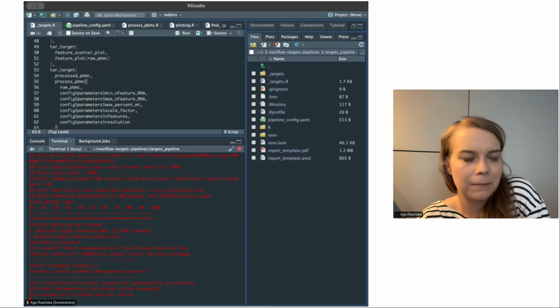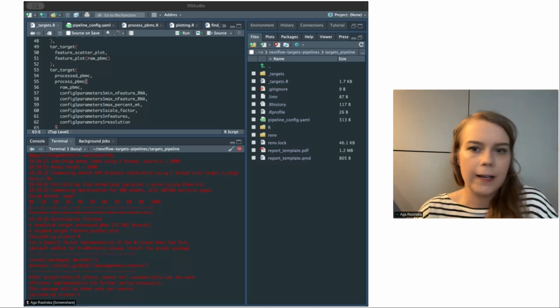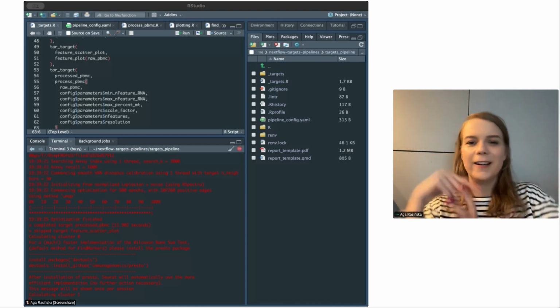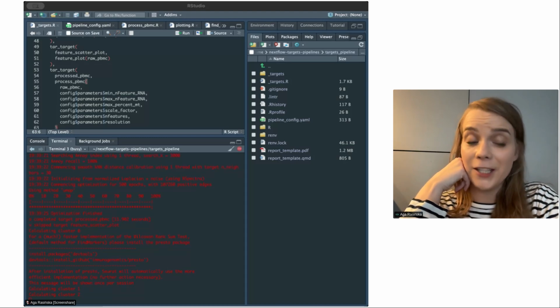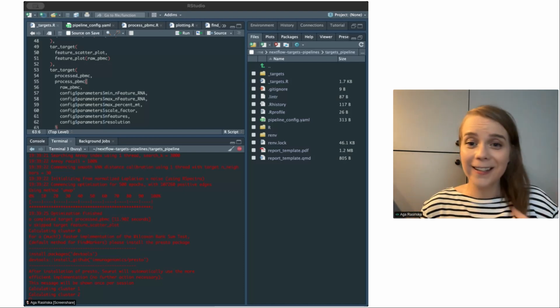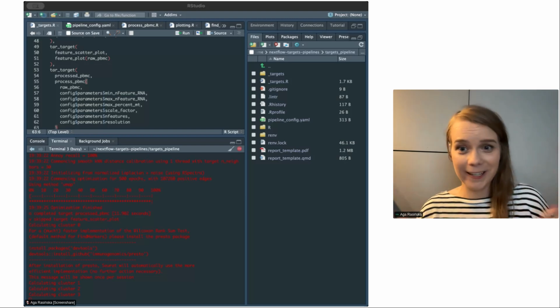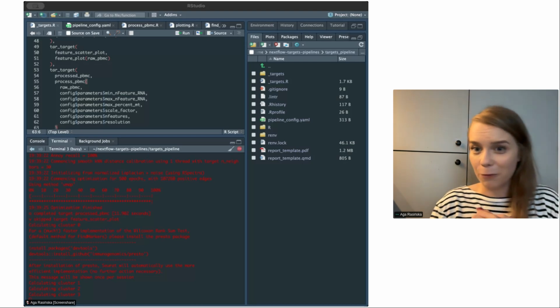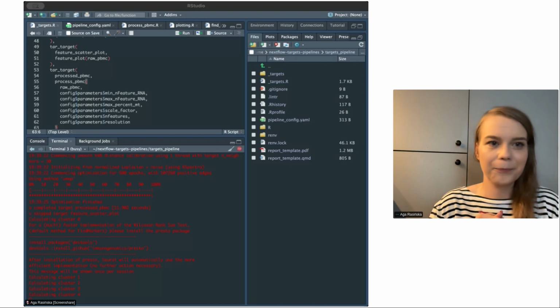Of course. So let's wait a few seconds. And calculating, there will be clusters, and you can already see, like here. Also, we need to wait a little bit to finish. So I would jump to give you the advantage of using the pipeline. If you're good with the run, you're just closing it and forgetting and waiting for your results to finish, not just waiting for one step and then going with another and another further.